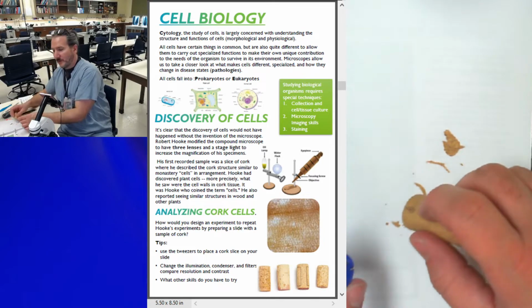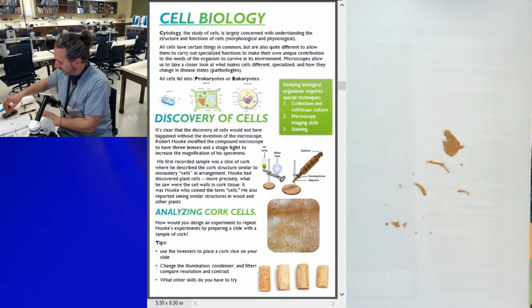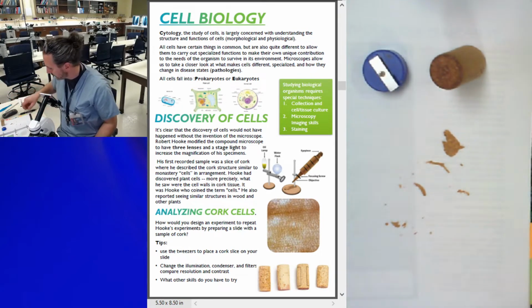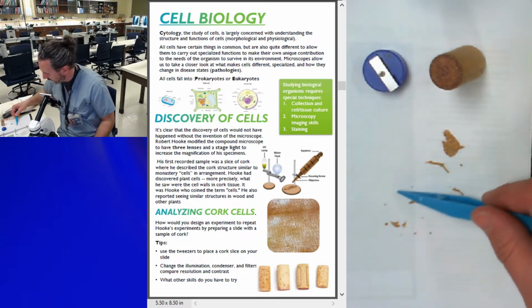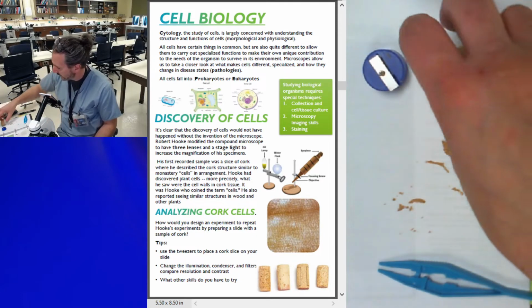There we go. So we have some shavings in there. Still have some stuck. That's really all you need. There's my cork, my sharpener, and my tweezers. I'm going to push some of these shavings together. That one I'm betting is going to be perfect. Alright?